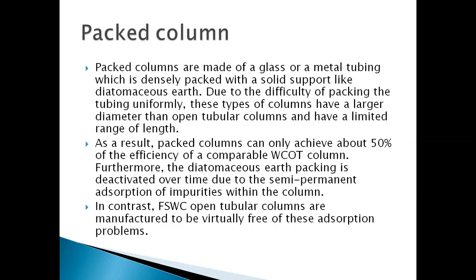Diatomaceous earth, or diatomite, is a naturally occurring soft siliceous sedimentary rock that has been crumbled into a fine white to off-white powder.